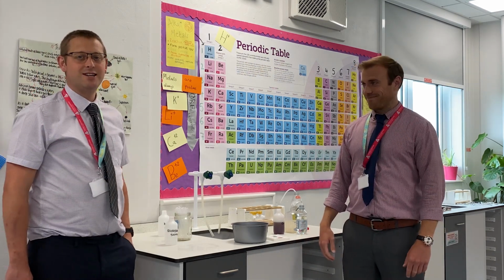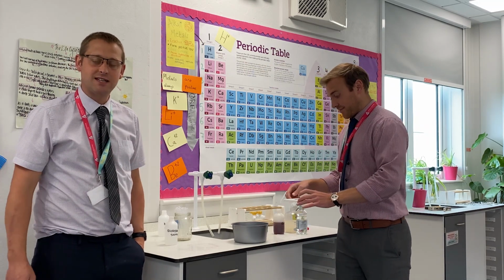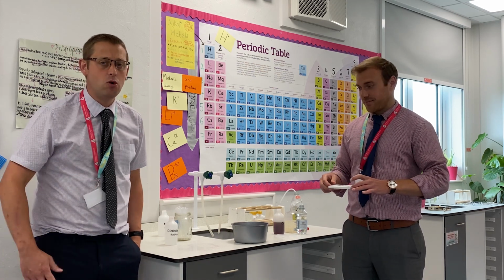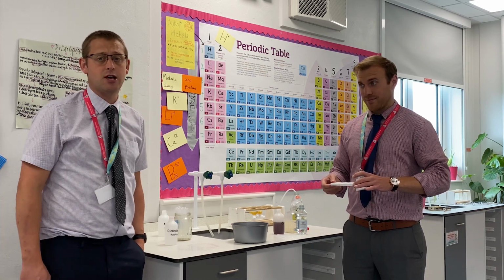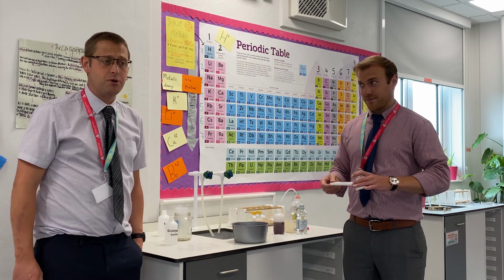Okay, well done guys. Hopefully you've been able to identify all of our chemicals today as acid, alkali and neutral, and that you've had some fun along the way. But one of the most important things we have here at Penrice is making sure that the workspace is clear and usable for the next people that come in. So clearing up is an important skill that you must develop.